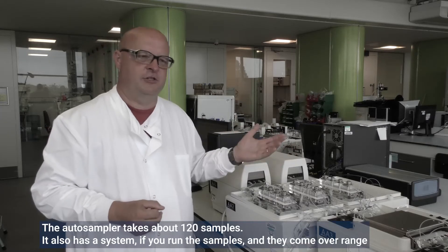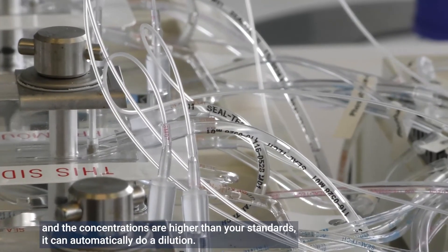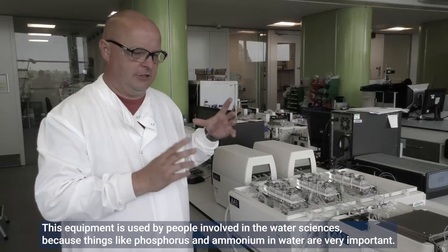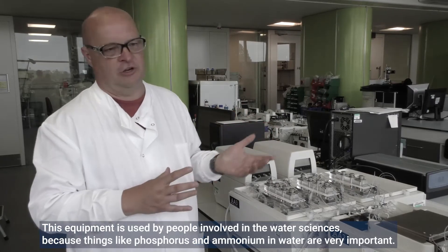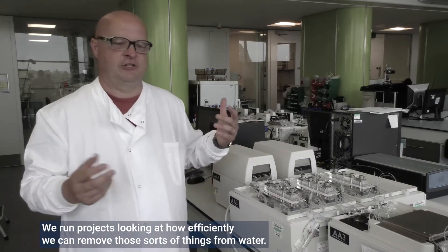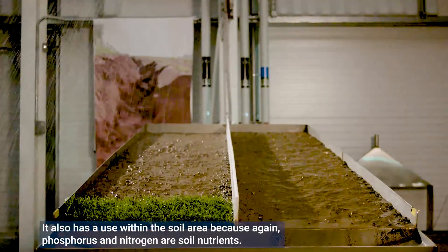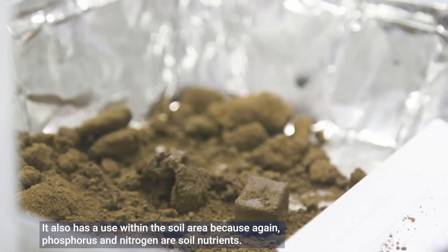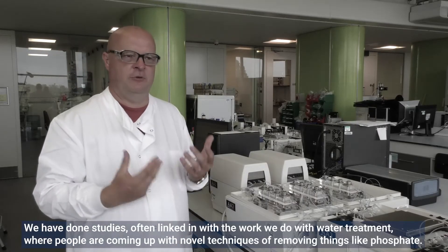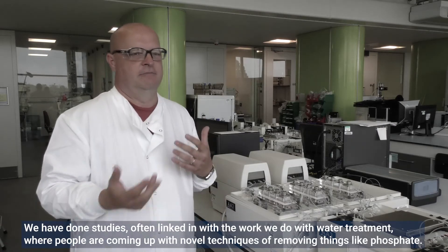The autosampler takes about 120 samples. It also has a system where if samples come over range — meaning concentrations are higher than your standards — it can automatically perform a dilution. This equipment is used by people in the water sciences because phosphorus and ammonia in water are very important, and we run projects looking at how efficiently we can remove those from water. It also has use in the soil area, as phosphorus and nitrogen are soil nutrients, and we have done studies linked to water treatment and novel techniques for removing things like phosphate.